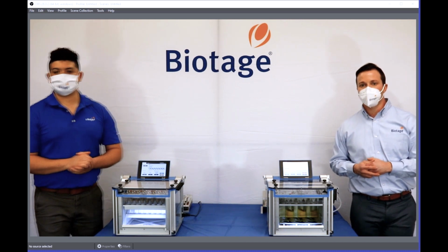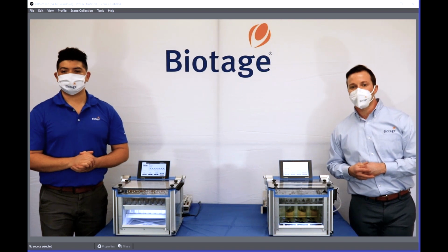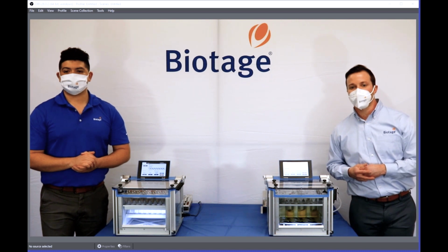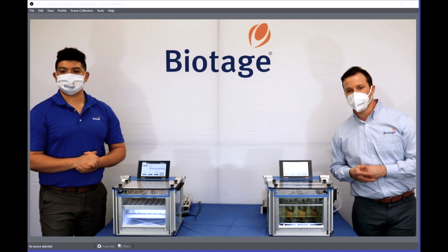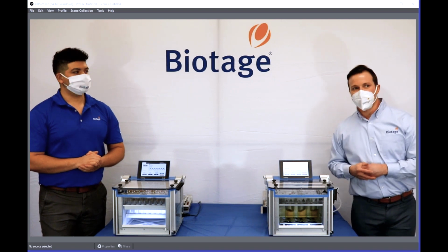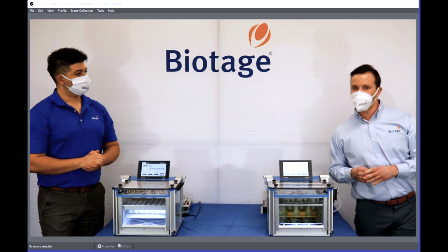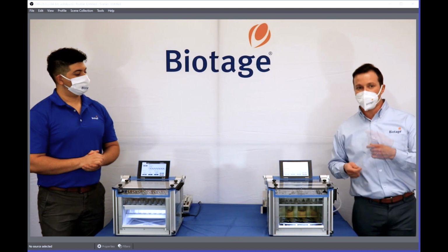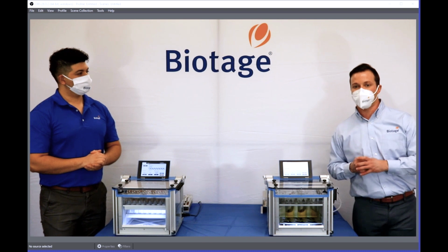It looks like Raul brought a second question. He asked, when it shuts down at the end of the program, will the nitrogen line pop off like the old TurboVap LB? So it sounds like you may have a bad connection on your nitrogen line. So I would suggest if it's popping off like that, there might be a little pressure that's building up once you turn it off and the internal gauge is shutting off.